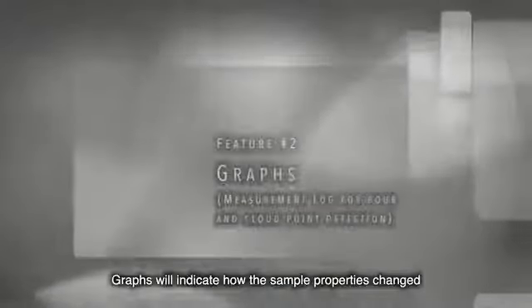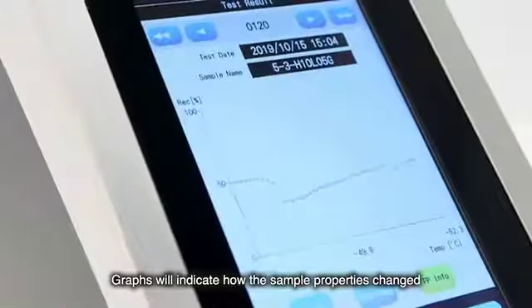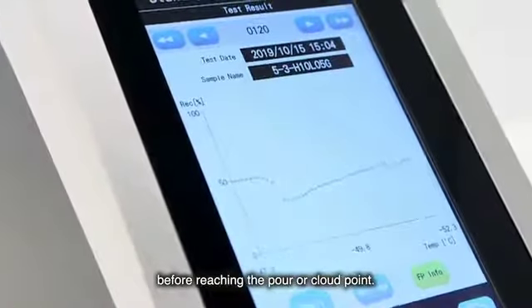Graphs will indicate how the sample properties change before reaching the pour or cloud point.